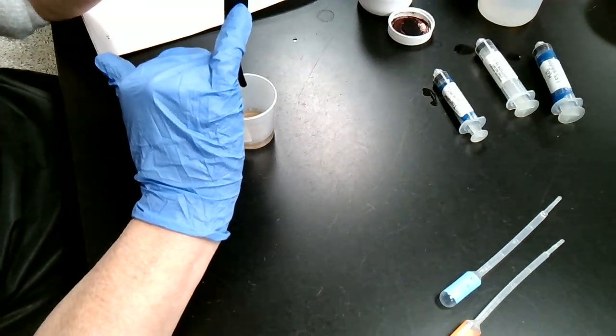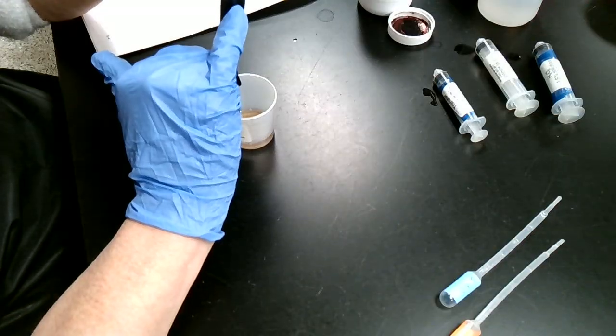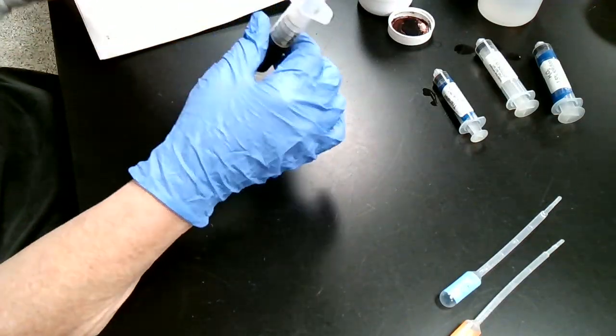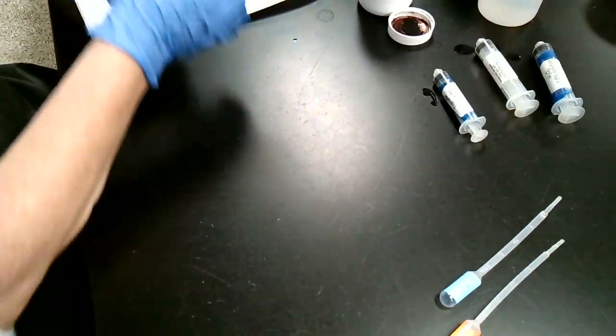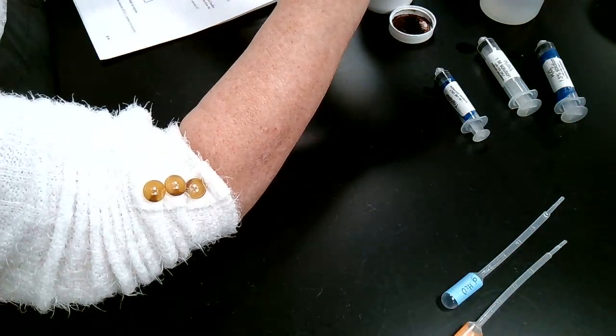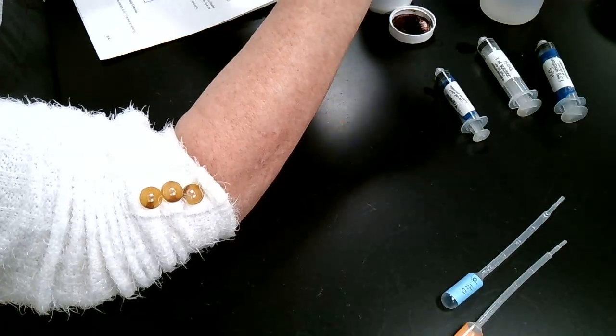I'm reading here. My initial volume was 5. I am now down to a little bit below the 4, so I'm going to call that at 3.9 as my final. Okay, so yeah, I know another drop just dropped in there, but that's okay. I'm going to squirt the rest of my potassium permanganate. So my final volume was 3.9, and your partner would be able to like write that down.